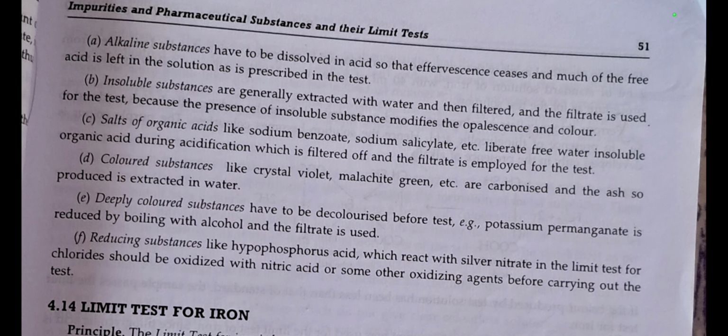Next, reducing substances like hypophosphorous acid, which react with silver nitrate in the limit test for chloride, should be oxidized with nitric acid or some other oxidizing agent before carrying out the test.